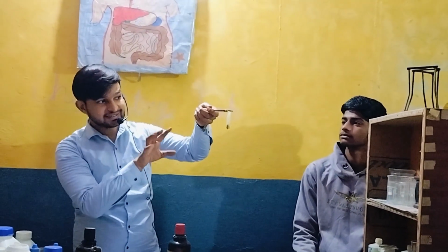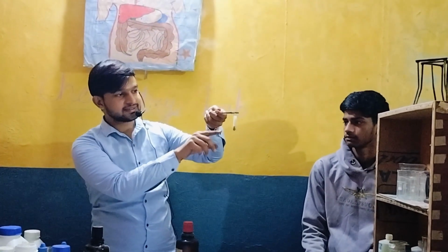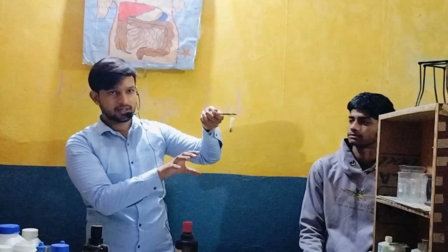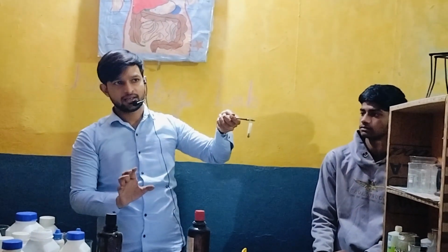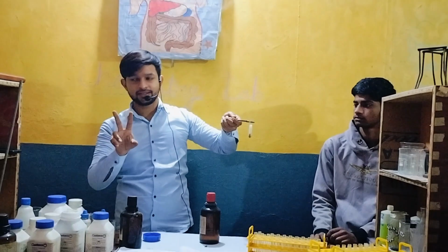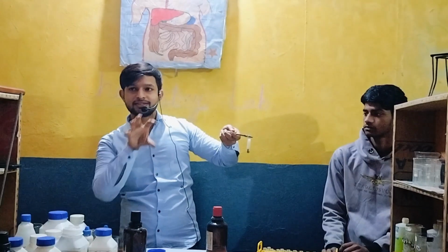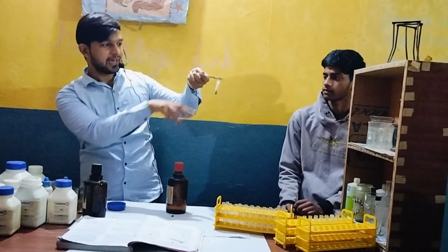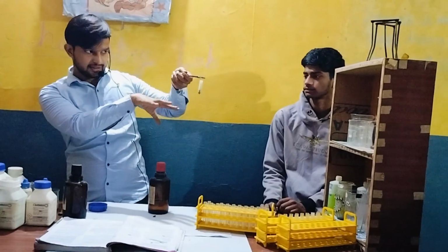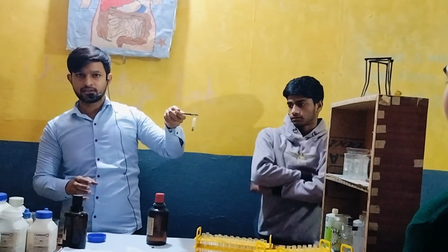So what is happening inside the test tube? We have taken the acid. The acid reacts with the zinc metal and hydrogen gas is liberated, as you can see. So there are two reactants, zinc and sulfuric acid. They react with each other and ZnSO4, that is zinc sulfate, will form and settle down in the test tube, and the hydrogen gas will come out from it.